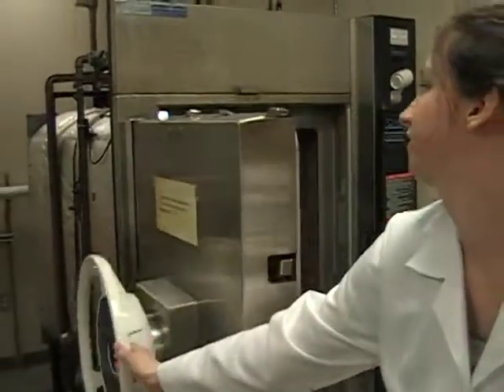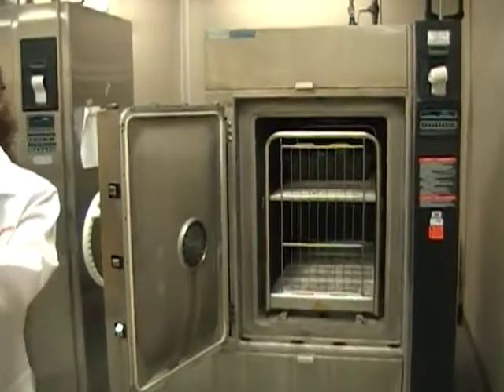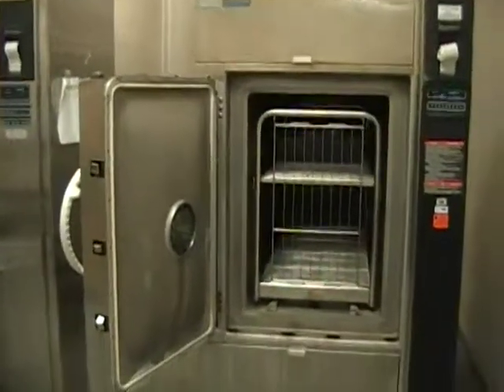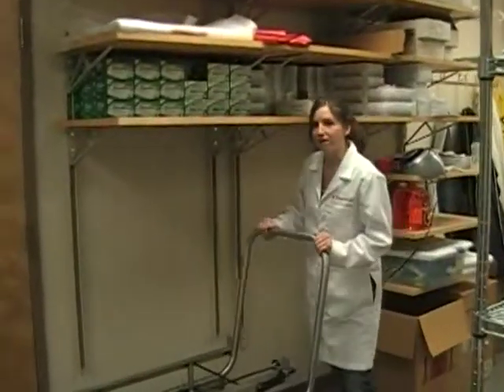First we open the doors. Now we grab our cart.